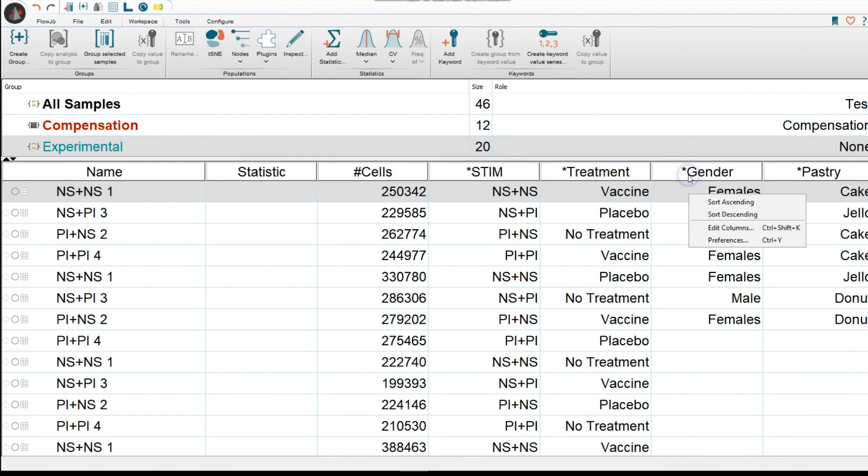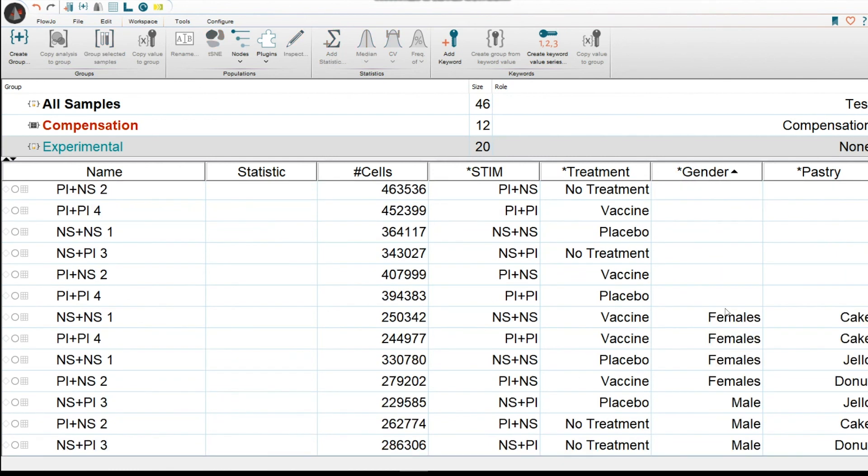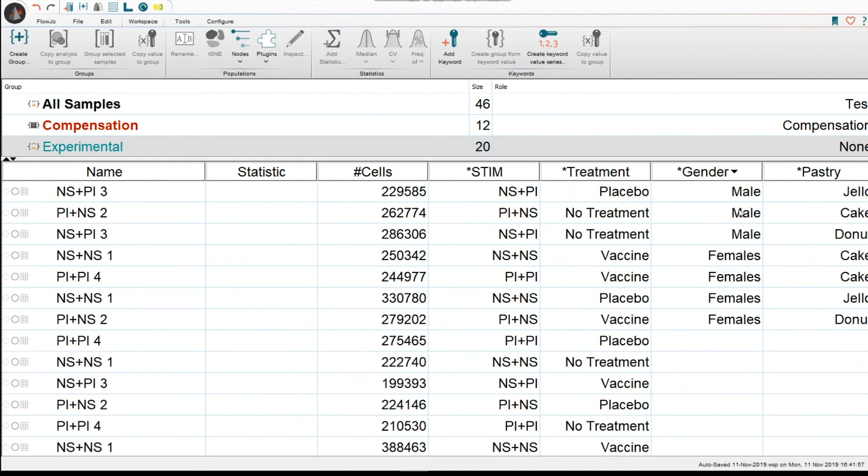Here you could also go to the header, right click, and do sort ascending. You will see them there. Or sort descending, and you will see it up here.